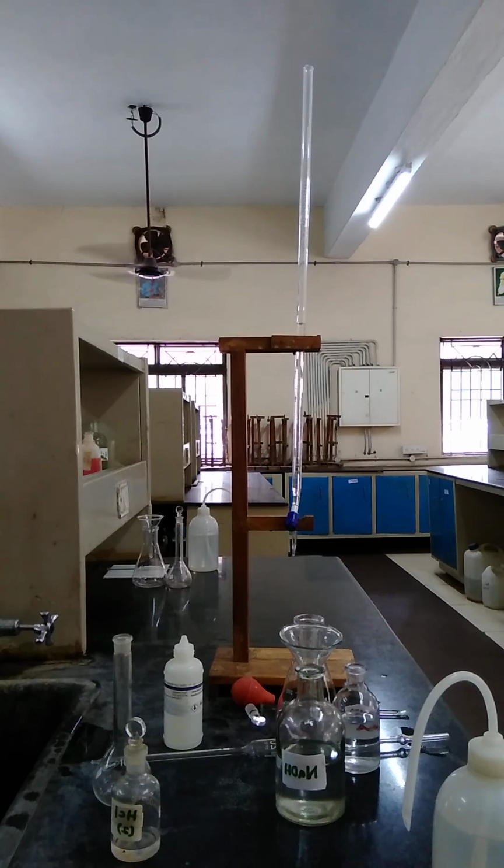Before that, we have to do the second titration, and then you do the calculation last. The second titration is the estimation of HCl, hydrochloric acid. The given sample is HCl in reagent water with bottle number 2. We don't know how much volume they have given. Normally they give 9 to 12 ml.